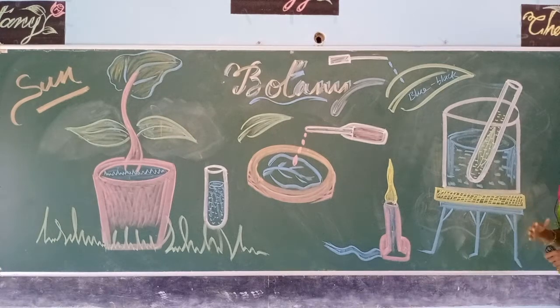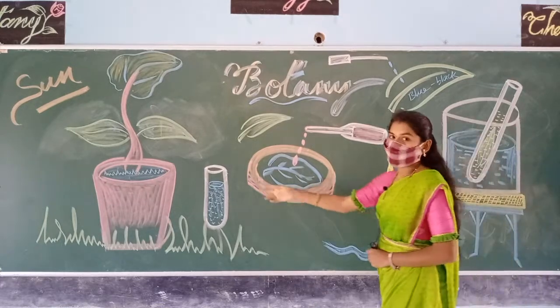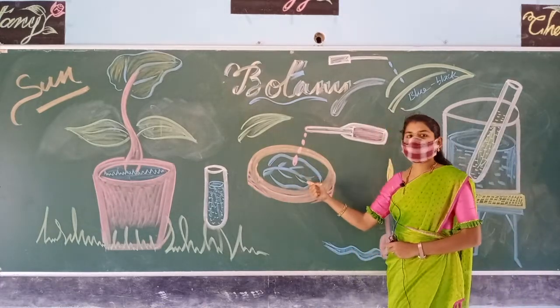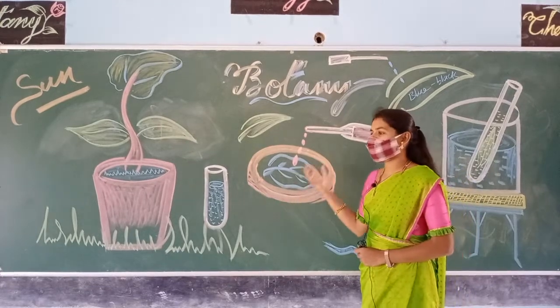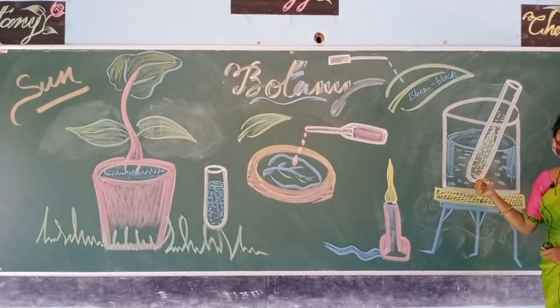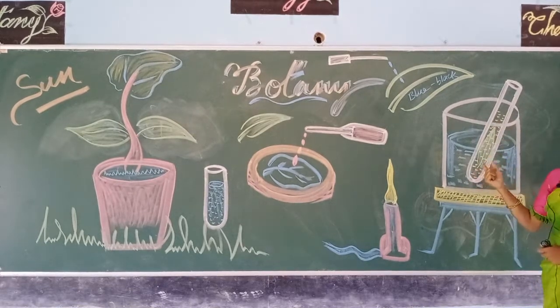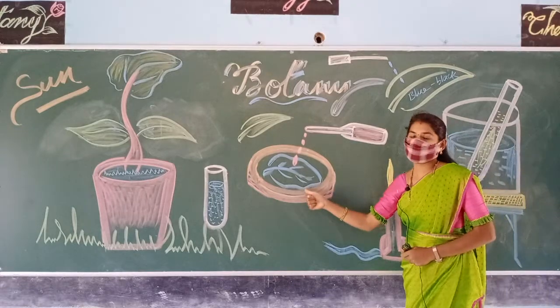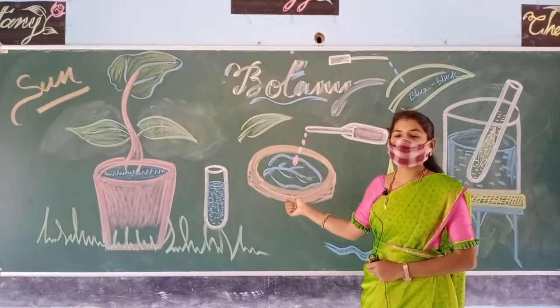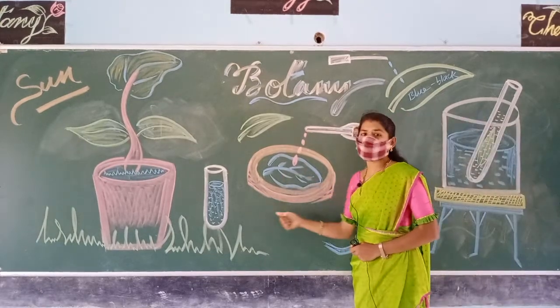Once boiled for 15 minutes, take out the test tube, remove the leaf, and place it in a petri dish. The leaf has turned pale white, meaning all the chloroplast and chlorophyll content has mixed with the spirit. The spirit, which was transparent before, turns green after boiling, while the leaf turns pale white — everything except the starch has evaporated or dissolved into the spirit.